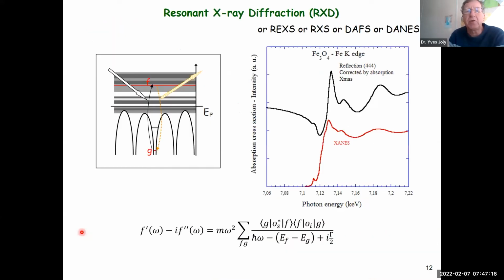So what is important to mention is that the code can calculate not only the XANES spectra or the emission spectra, but also make the analysis easier, showing what states participate in such a bump in your spectra. The code can also calculate resonant X-ray diffraction.